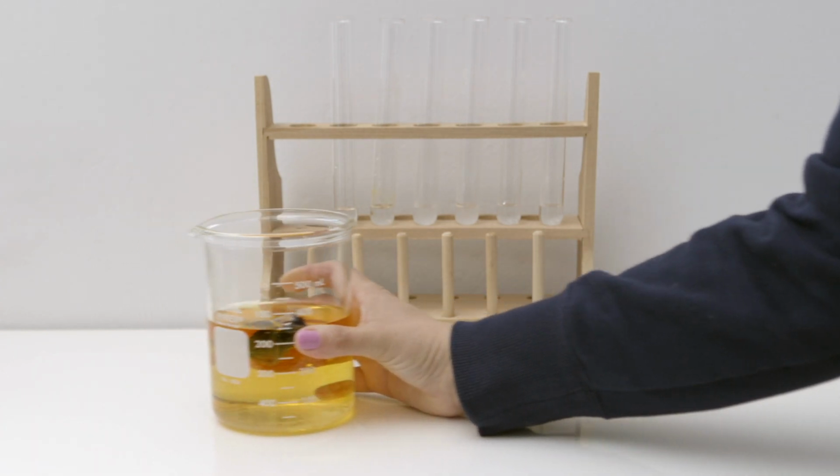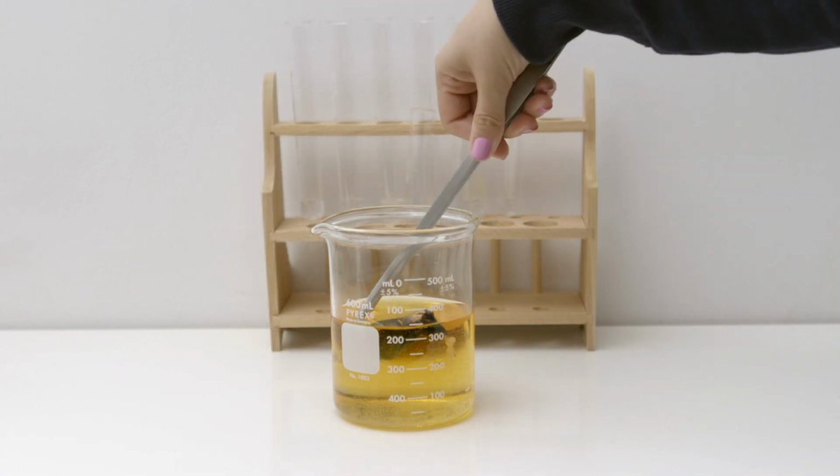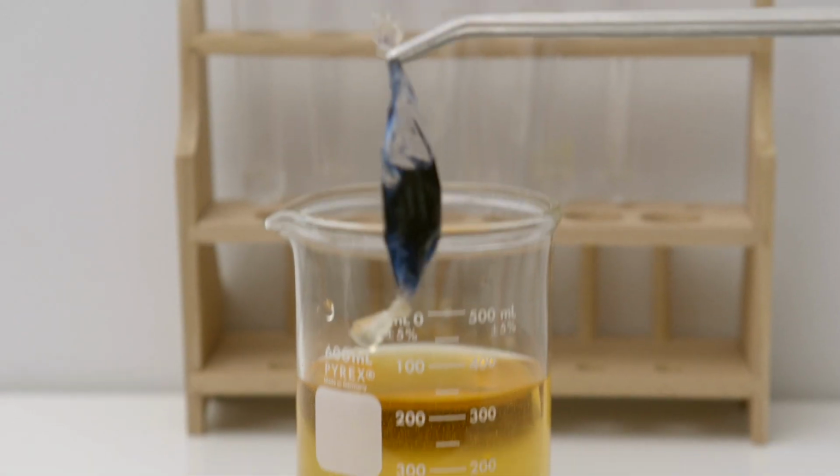After 8 minutes, we observe that the liquid in the beaker is still amber, but the cell has changed color from colorless to blue-black.